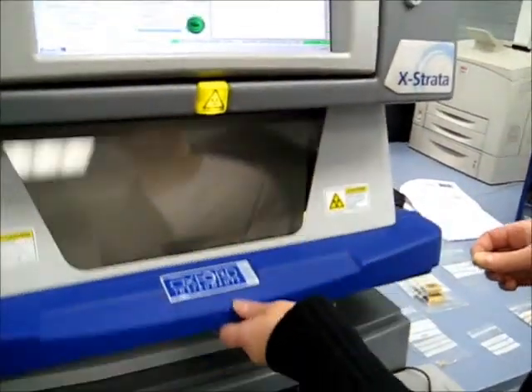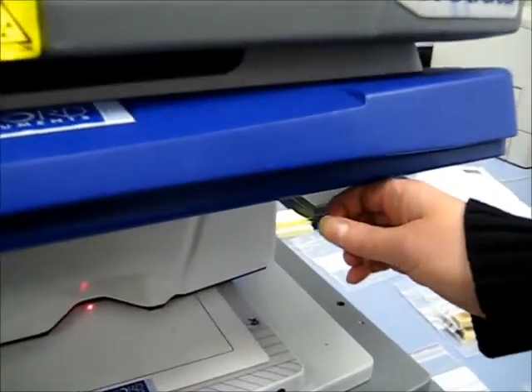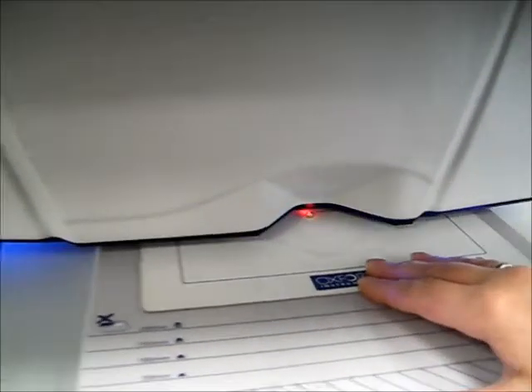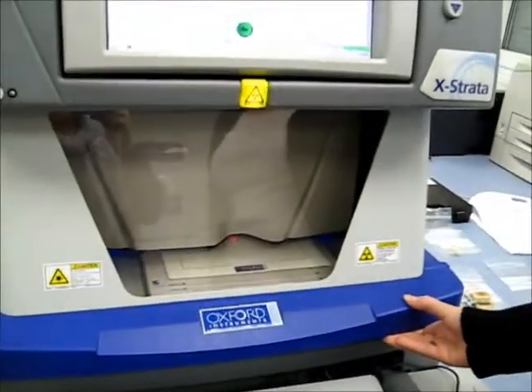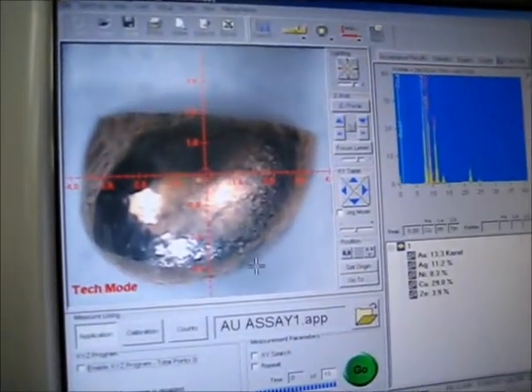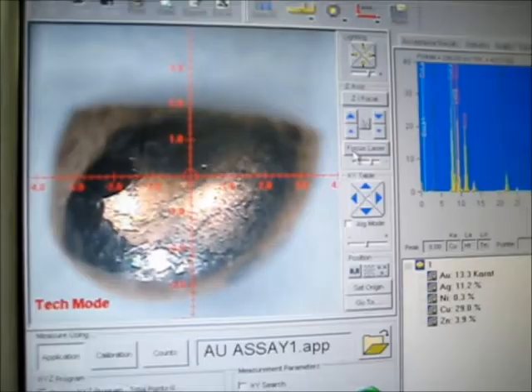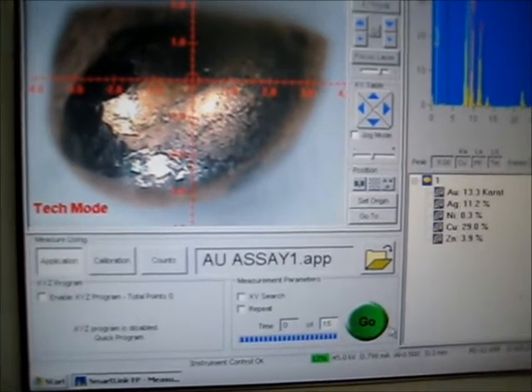The measurement by Extrata is quite simple. You take your sample, put it on the measurements table under the red spot of the laser, close the chamber, focus on the measurement spot — the laser point — in order to control the distance between the sample and detector, choose the correct method, and press go.